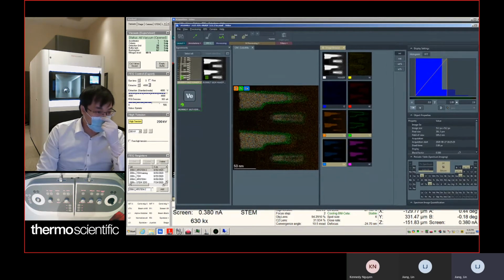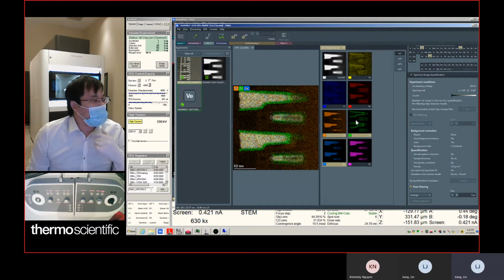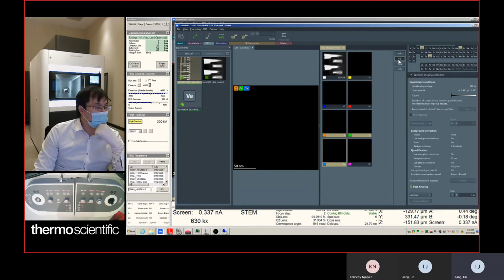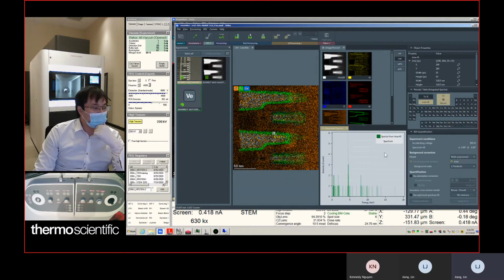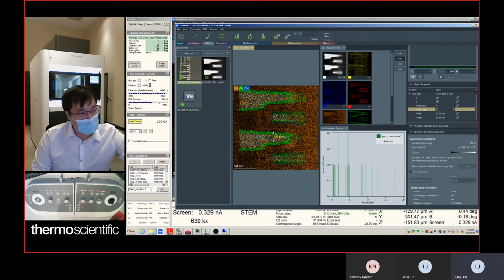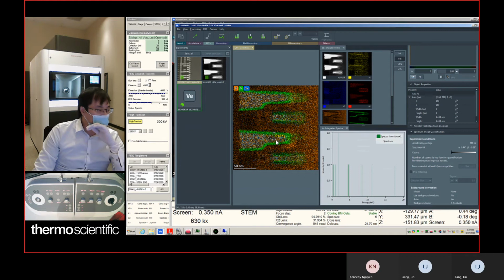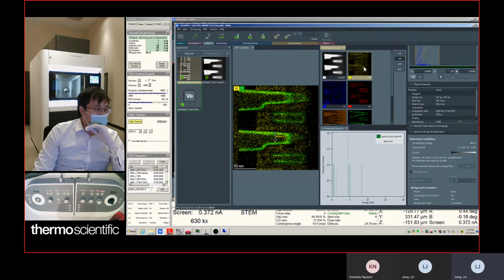You can do a little bit of filtering, and you can define the behavior. You can view, expand and lock.